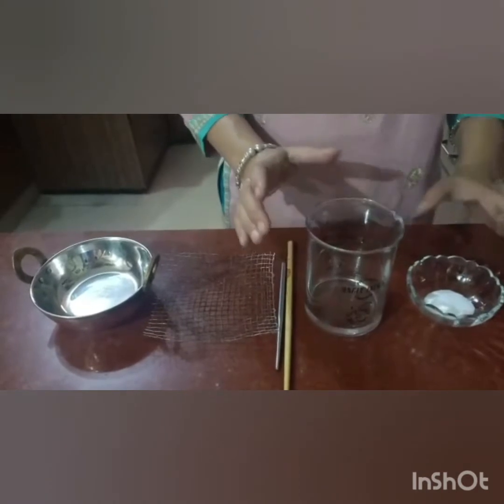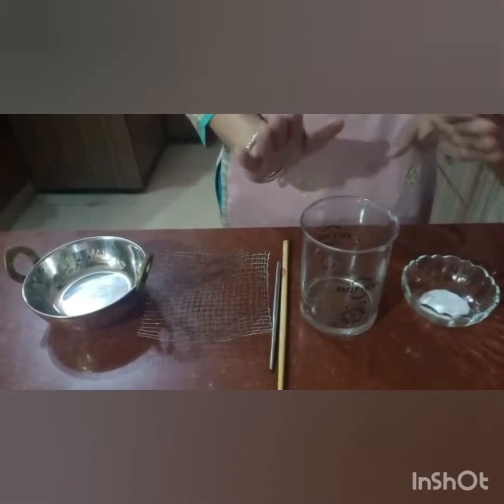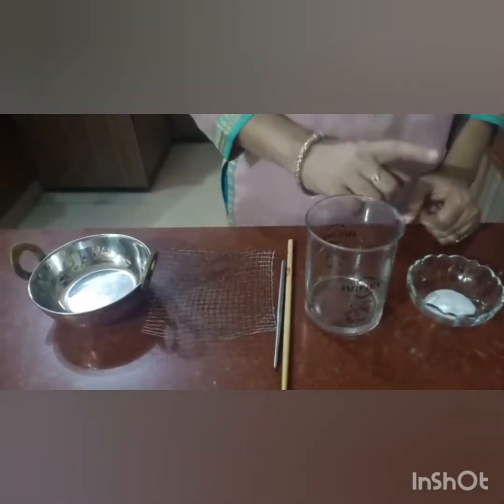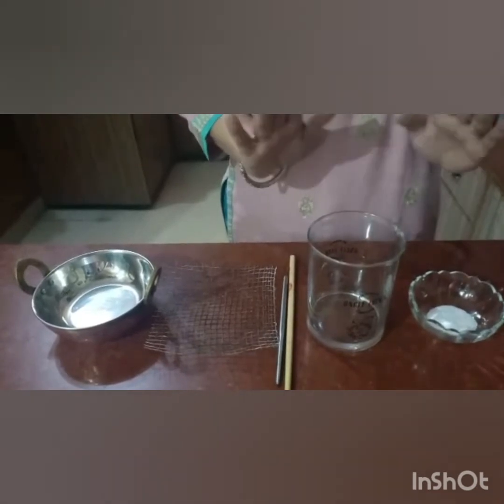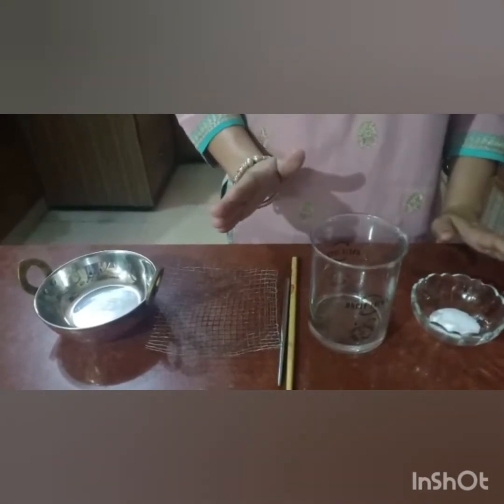Now children, I'll show you experiment number 1. Okay, so I have given the number 1 to it. Now what is the aim of this experiment? The aim is to separate salt from its solution. Okay, this is the aim of the experiment. Then comes the next heading, aids. What do I need for this experiment?